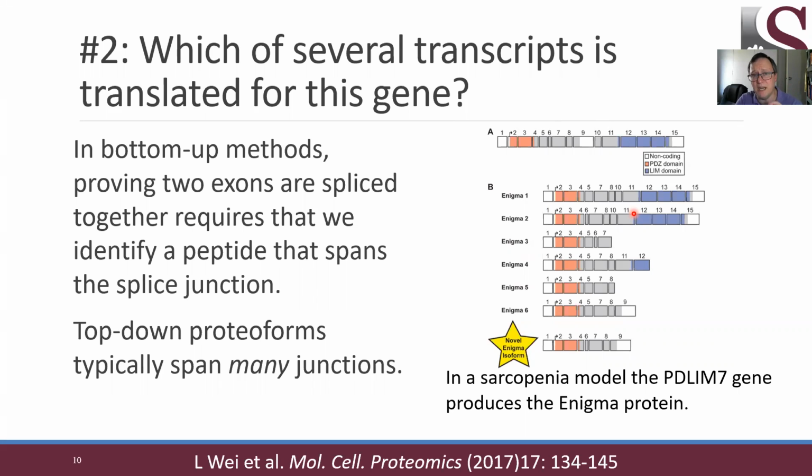This is because in many cases, people who download reference proteomes for use in identifying tandem mass spectra only download one isoform, one translated transcript to represent each gene. As a result, their sequence databases don't contain all the different isoforms that could be detected. They include only the longest, typically, if you're grabbing it from SwissProt.